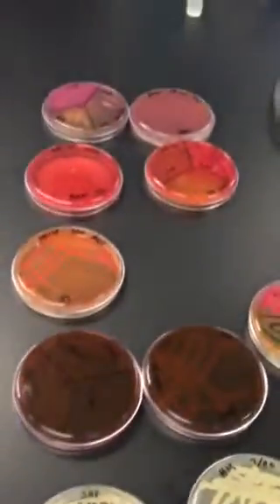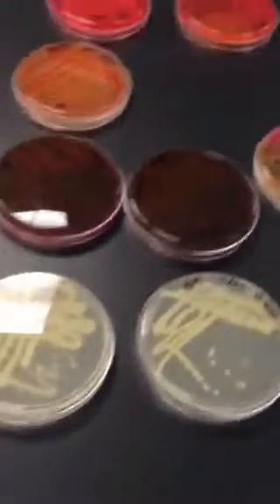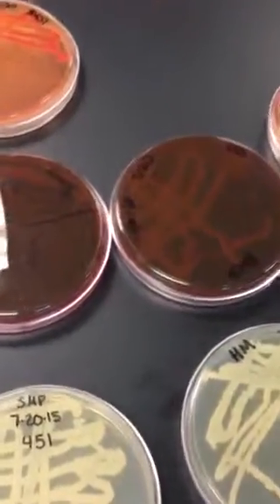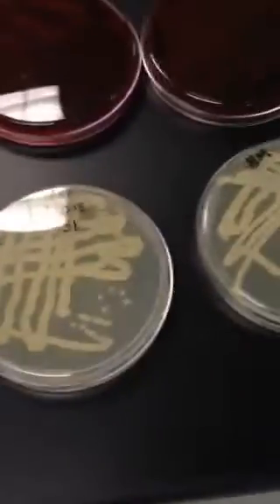And now we're going to compare the plates. With the plates, we should be able to rule out what it's not from the known bacteria. And if it resembles one of the known bacteria, that might help you confirm that it's the same as the known. So, for example, I probably have a set of plates to show this.